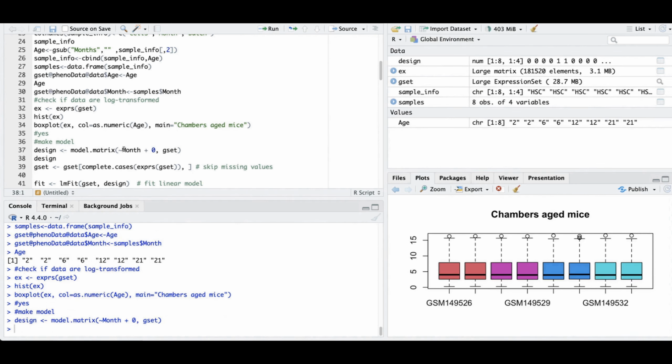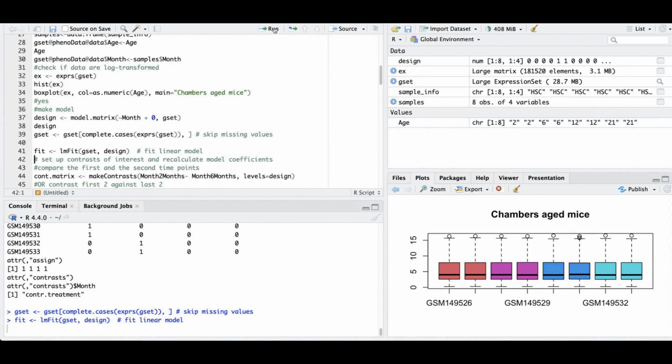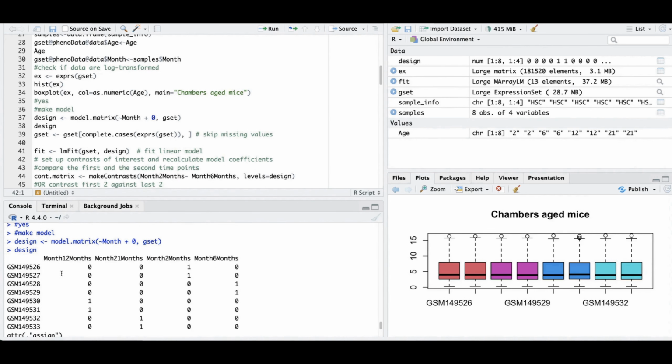And it is one factor, it's only month, nothing else. And then we do the fit. And what we fit is, so far, everything. And now there is a question. For contrast, what shall we use? Of course, you can use 2 out of 4 groups, for instance, comparing 6 months to 2 months. But then you realize that 2 and 6 is, formally speaking, young mouse.